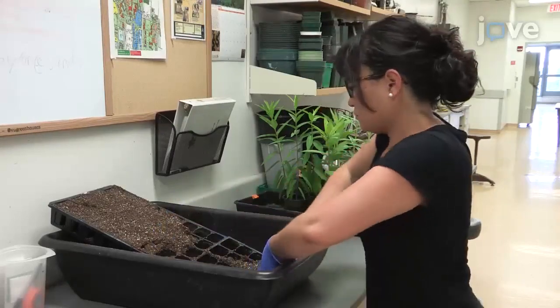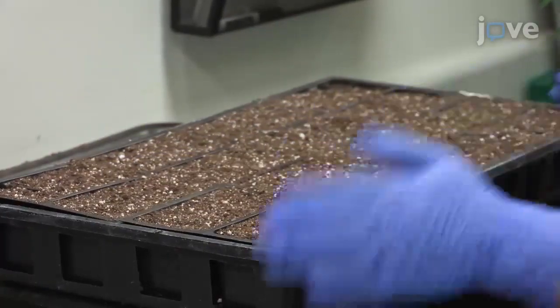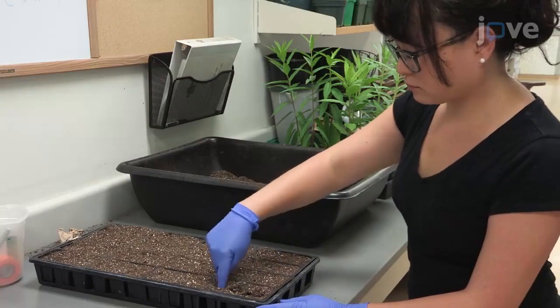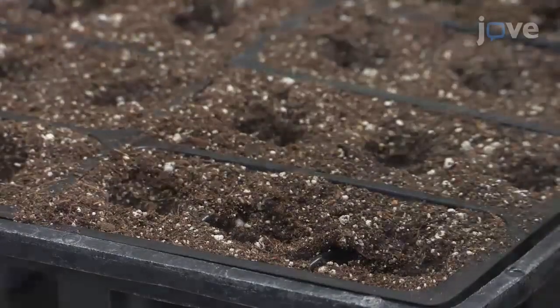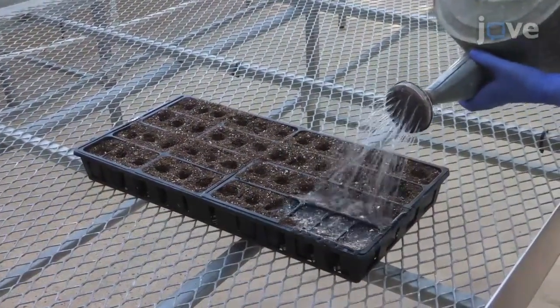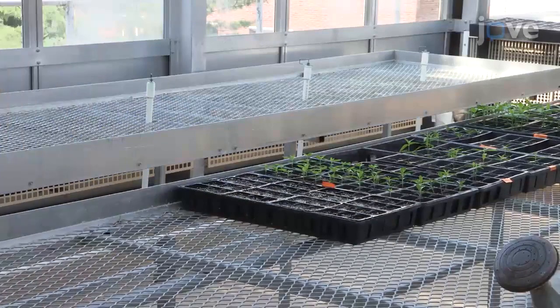Begin by filling a standard seedling tray with germination mixed soil, taking care that the soil reaches the top of the wells. When all of the wells have been filled, make a 3 cm deep hole in the soil of each well and place one seed into each hole. Water the cells until the soil covering the seeds is saturated and place the tray in a greenhouse with daily to every other day watering to maintain a moderate soil moisture level.